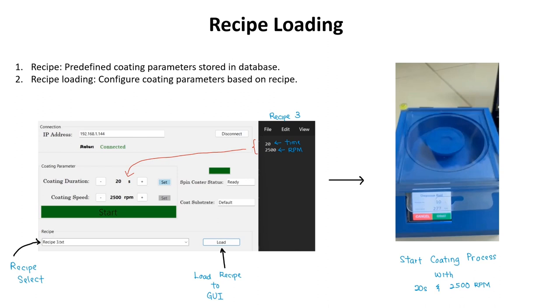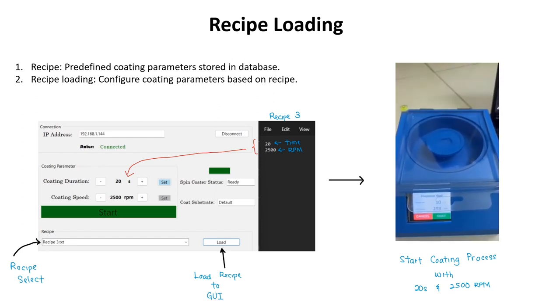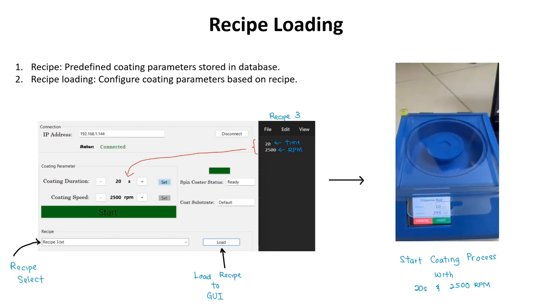Recipe loading is one of the features of the spin coat system. The recipe is a predefined coating parameter stored in the database. Here, recipe 3 was chosen and loaded into the system as shown in the GUI.